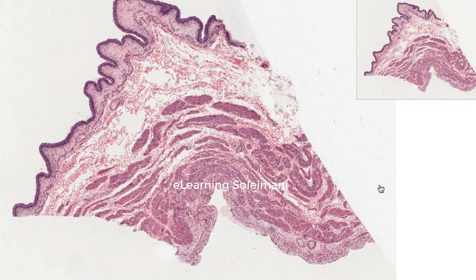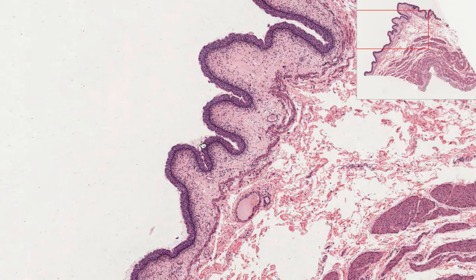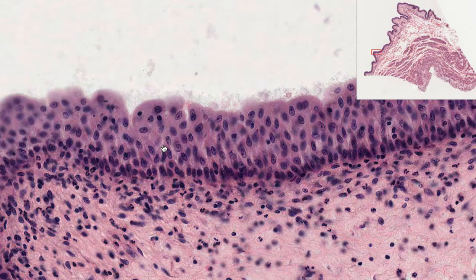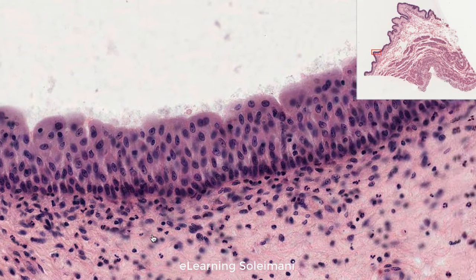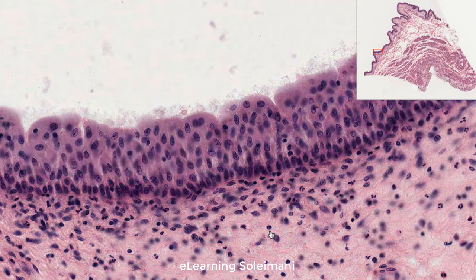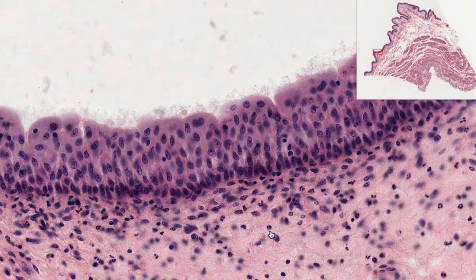The next slide is the urinary bladder. The transitional epithelium is specific to the urinary system. It is unique in that it is able to stretch and expand as the bladder fills with urine without rupturing. In transitional epithelium, there are typically three layers: the basal layer, the bottom layer of cells resting on the basement membrane, typically cuboidal or columnar in shape; the intermediate layer, the second layer above the basal layer, with polygonal cells of variable sizes and shapes; and umbrella cells, the top layer that are dome-shaped, wide, and almost completely cover the surface of the tissue.